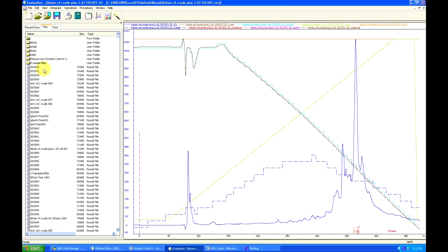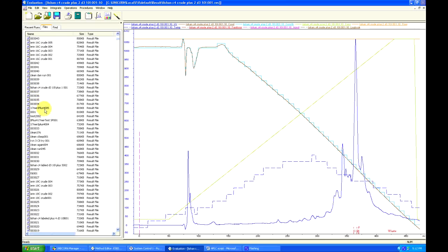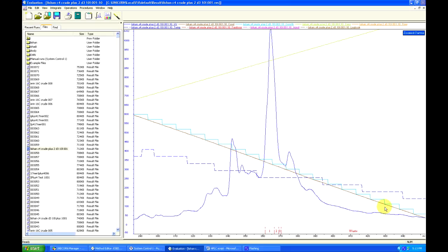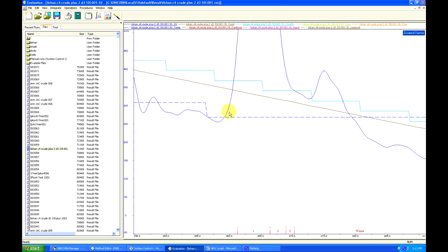In the evaluation window on the left side, we can see a list of all the previous runs listed by name. We can double click a name to open that run. We can then analyze the chromatogram and the quality of our fractions using a left click drag function to zoom into specific areas of the chromatogram. Zooming in further, we can see exactly where our fraction collectors started and switch collection in a specific test tube.